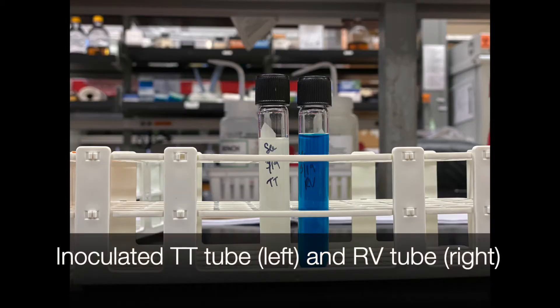Here are the inoculated tubes. The inoculated tetrathionate tube is on the left and it's a milky white color, and the RV tube, which is blue, is on the right.